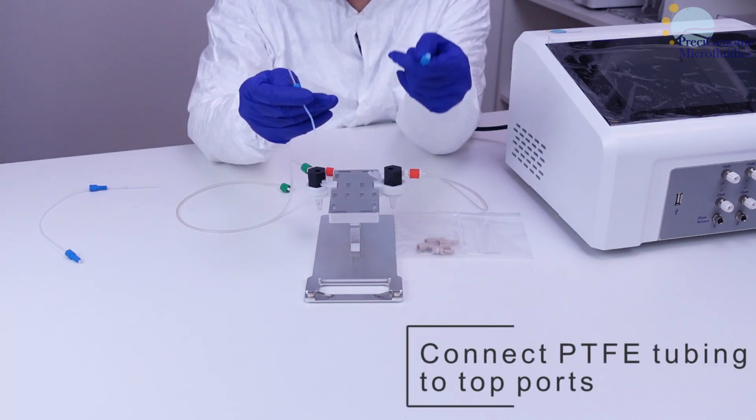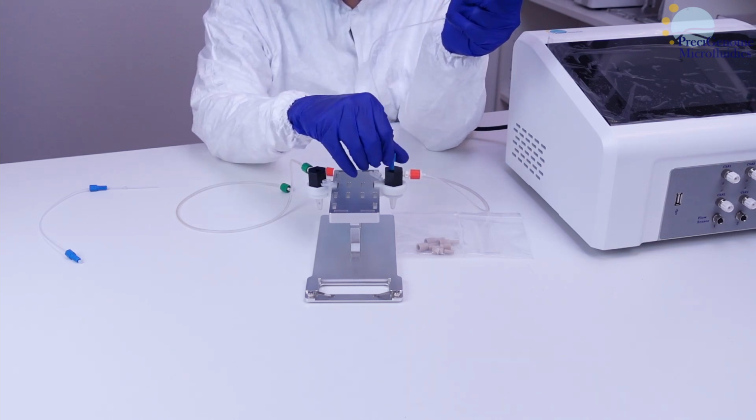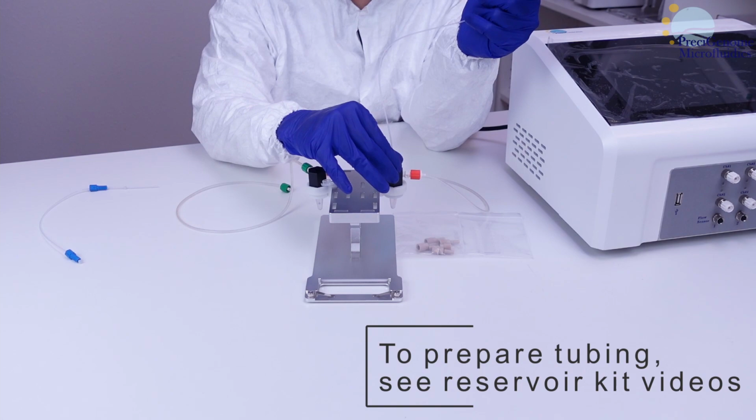Next, connect PTFE tubing through the top ports. For how to prepare this tubing, please see the reservoir kit video tutorials.